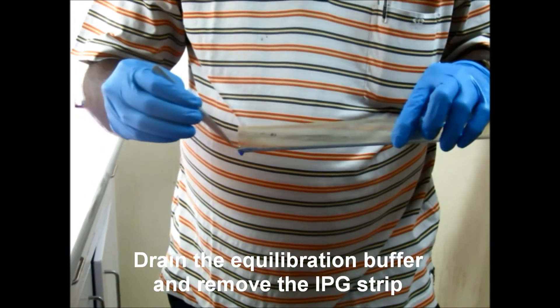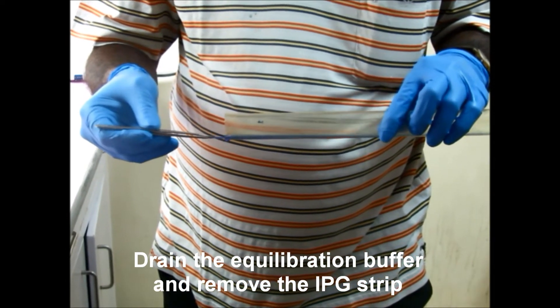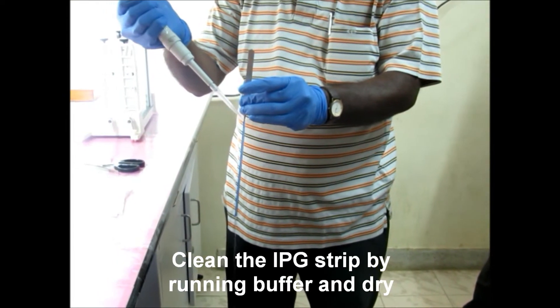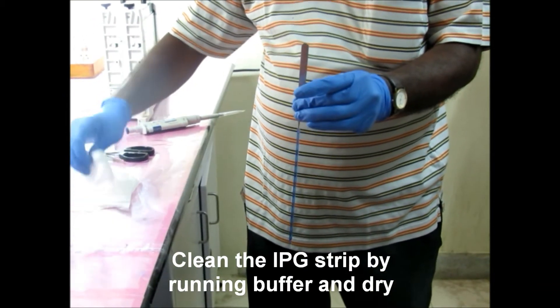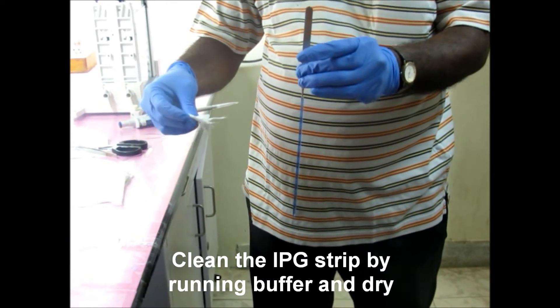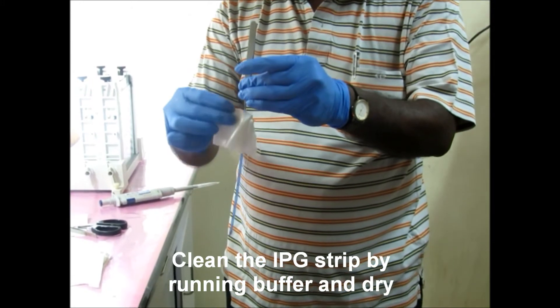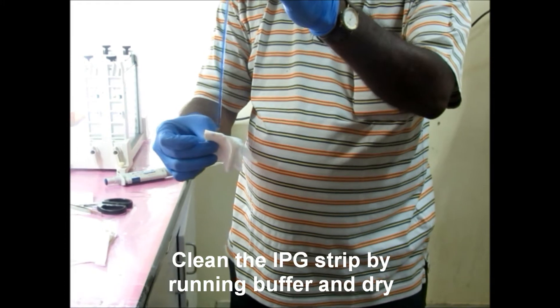After equilibrating, drain the equilibration buffer and remove the IPG strip. Clean the IPG strip using running buffer and dry it well with the help of tissue paper. The tissue paper soaks all the moisture from the IPG strip.